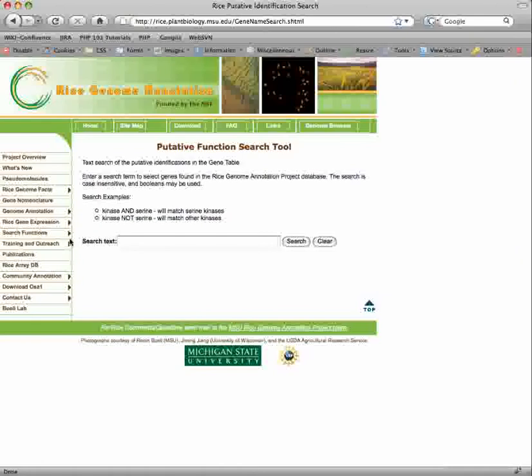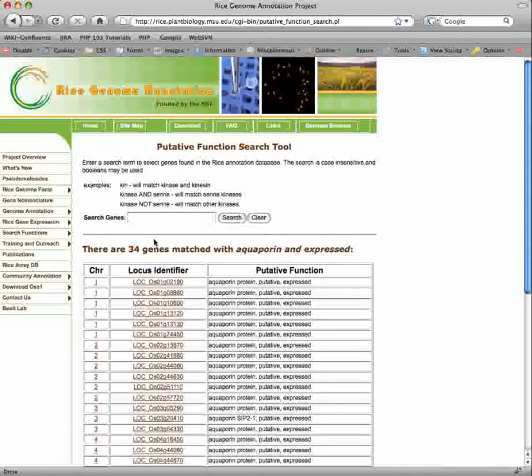On the putative function search page, we can search the functional annotation of the rice genes. Let's try 'aquaporin' and 'expressed.' This will give us only aquaporin genes that have experimental expression support. 34 genes in the rice genome are annotated with aquaporin and are expressed.